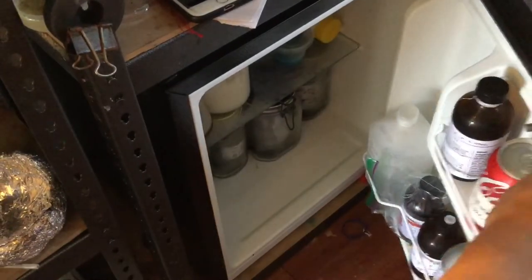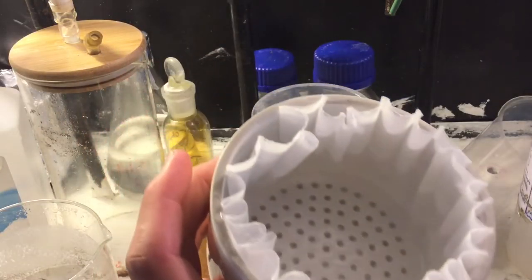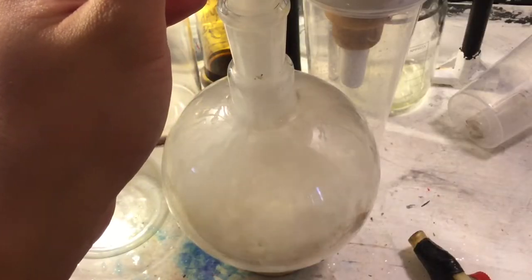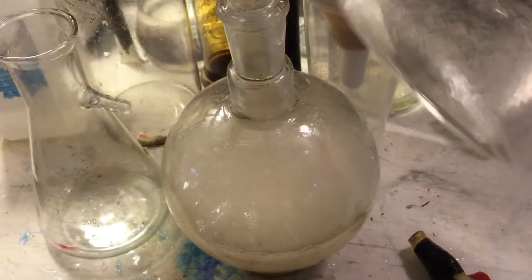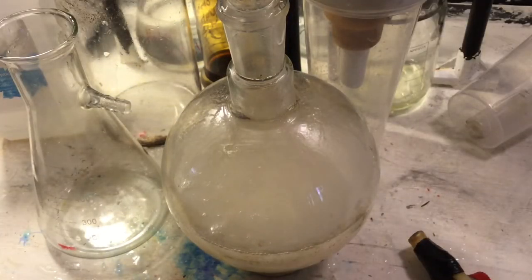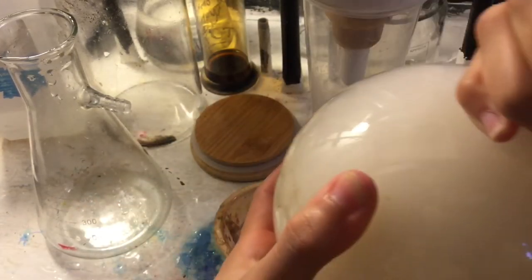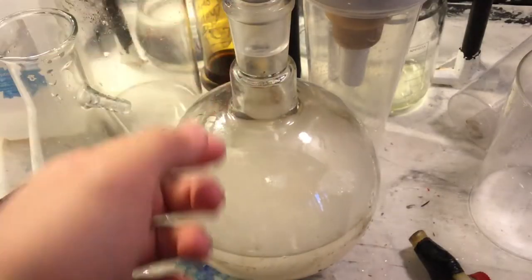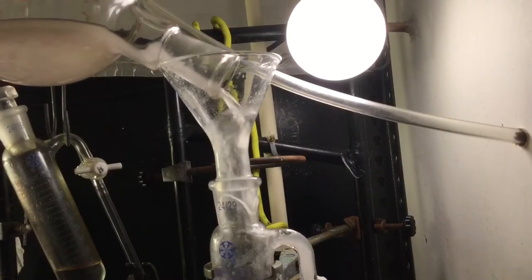After it's around room temperature, I confirmed nothing was captured by the filter paper. So I add it into a flask and shake it with some chloroform. If you have a 1-liter separatory funnel you can use that, but I don't, so we're just using a flask. You could also use another solvent, but chloroform is quite convenient because lidocaine is quite soluble in it. Just shake it around and let it settle, then add it into a separatory funnel.